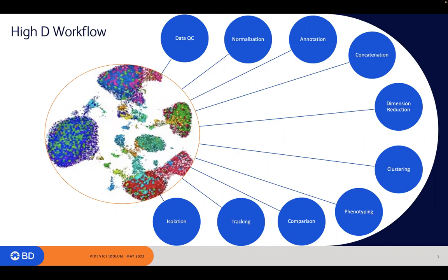Some people may also have different cytometers in different locations. So somebody in San Diego and another person in New York may have the exact same machine running the exact same panel, and they want to make comparisons, let's say, between those two patients. Normalization would be very important for that type of setup. And again, CytoNorm is what FlowJo has. There's a couple of other R-based tools out there as well. They're freely available, so definitely worth giving it a shot.